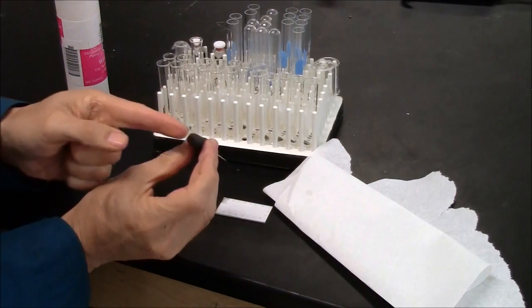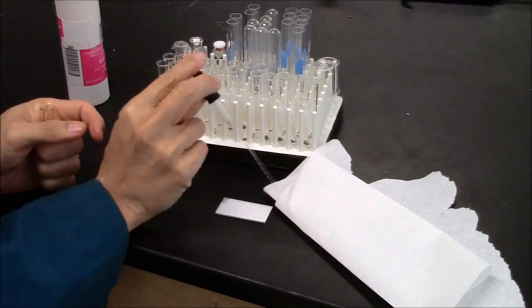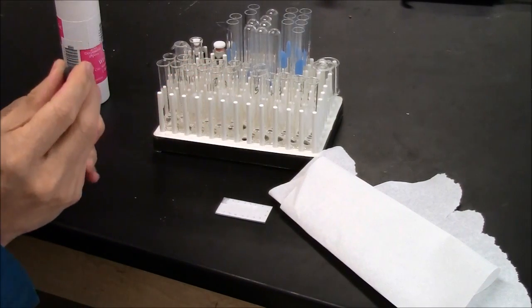I am using the bulb to help me here. The bulb has a hole. If I cover the hole and push, I'll get rid of everything in the pipette.